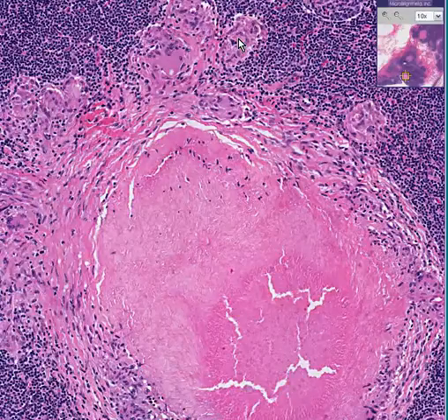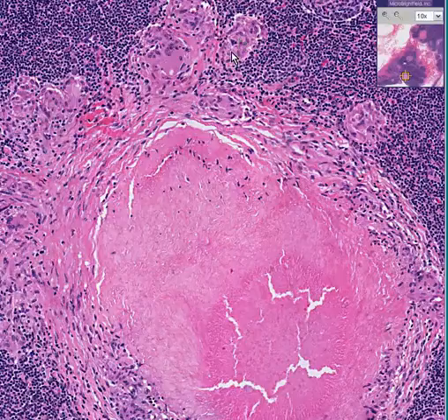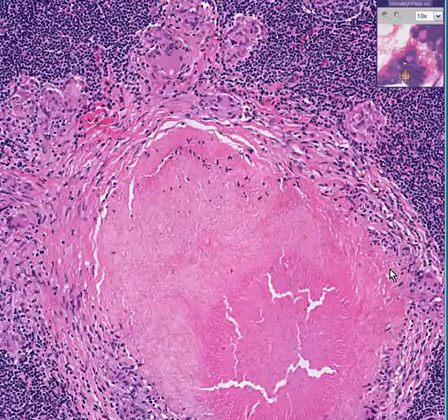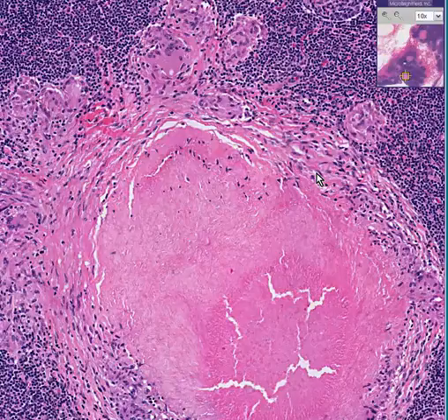If you did a Ziehl-Neelsen stain, especially in a kind of a transition between a necrotic area and where you see histiocytes, like perhaps here, you could very easily see the little acid-fast rods staining very nicely with the acid-fast stain or Ziehl-Neelsen stain.